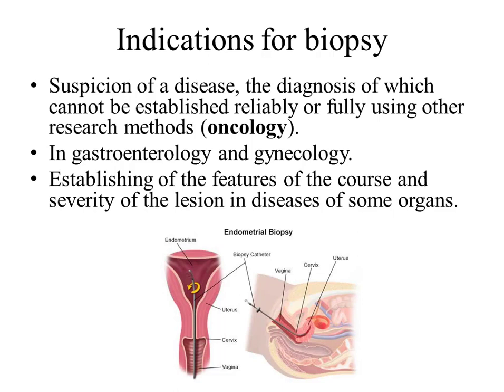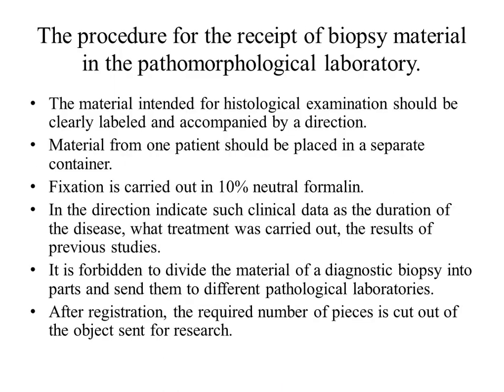Etiology also possible. The procedure for the receipt of biopsy material in a pathomorphological department or laboratory includes a lot of main positions. First of all, the material intended for a histological examination should be clearly labeled and accompanied by the direction. Material from one patient should be placed in a separate container.